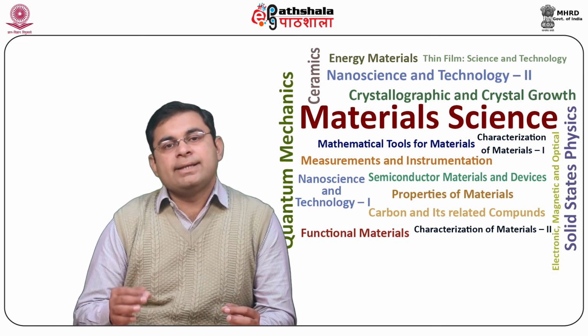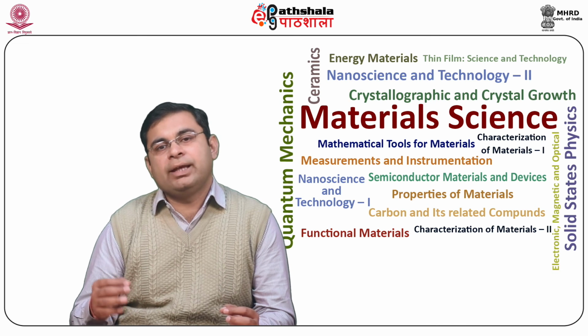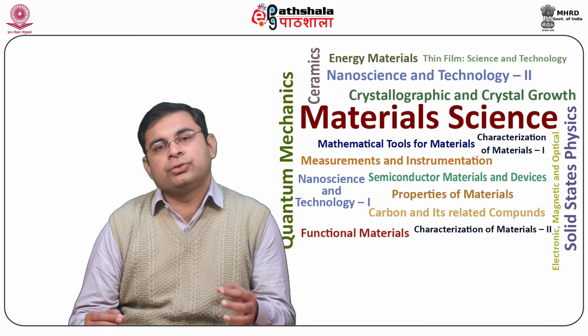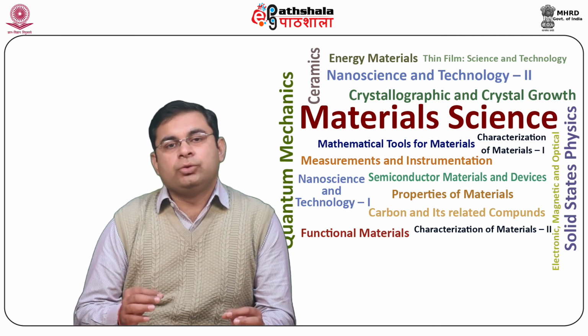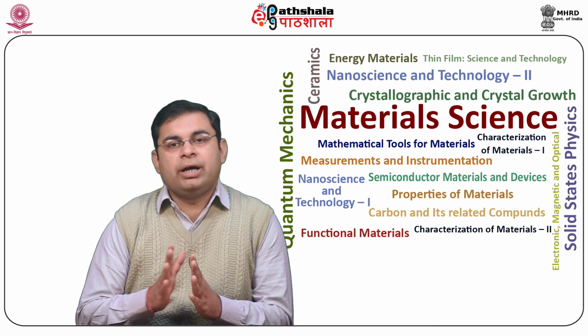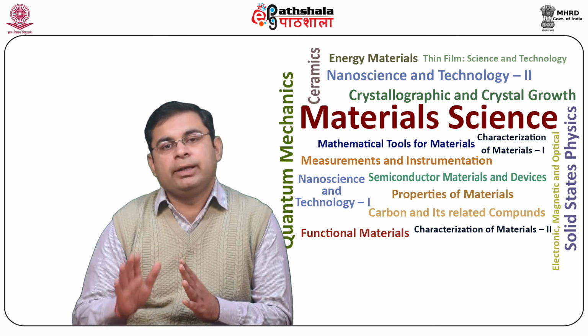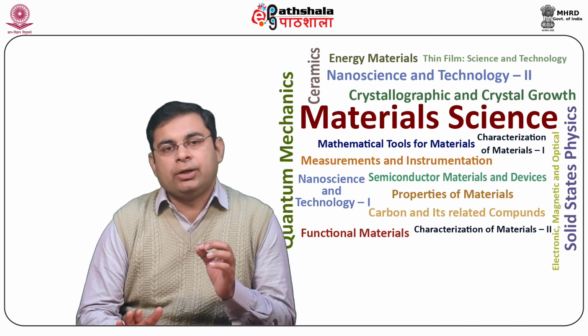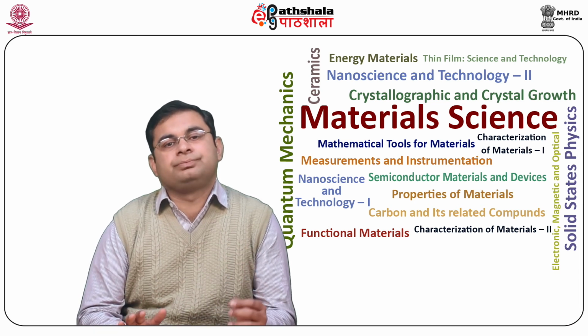Retarding field analyzers suffer from inadequate energy resolution and poor signal to noise ratios due to the average transmission efficiency. Thus, RFA is generally employed in low energy electron diffraction investigations and is not preferred for AES.